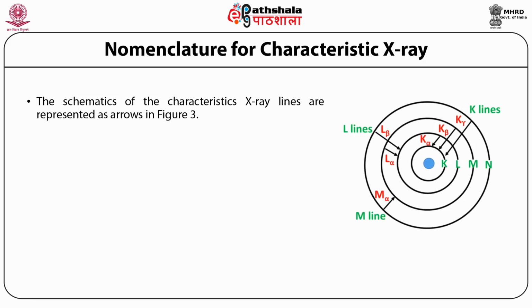The schematic of the characteristic X-ray lines is represented in figure 3.